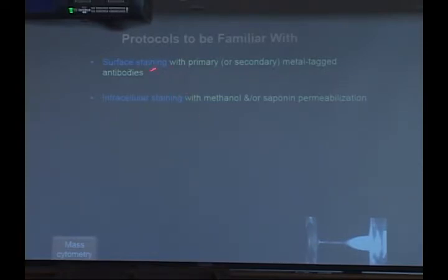So clearly, the surface staining and the intracellular staining should not be any different from fluorescence. Now you get into a mass cytometry specific protocol, namely iridium and rhodium. The intercalator protocol intercalates into the DNA and lets you know you have a cell. Testing pre-conjugated antibodies available from DVS. I don't think anybody else sells metal conjugated antibodies, unless we do, yeah.